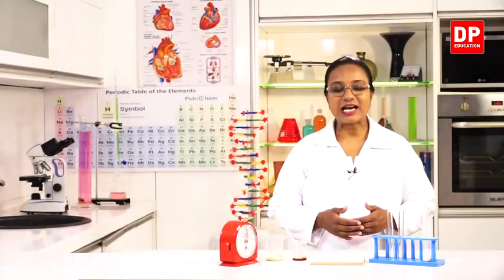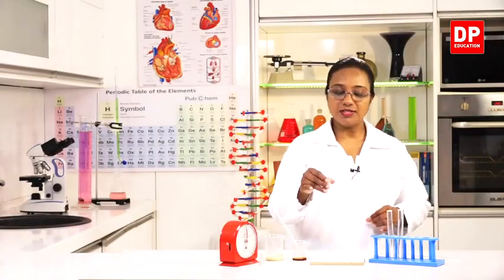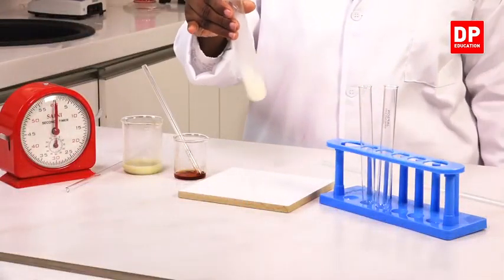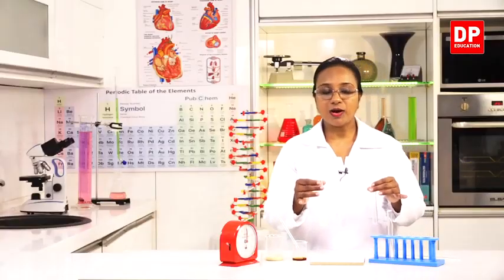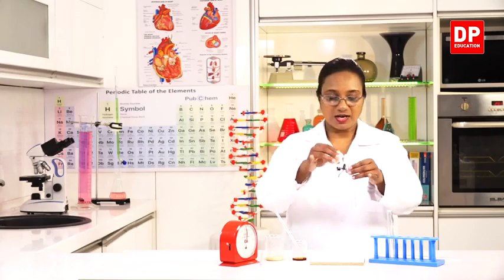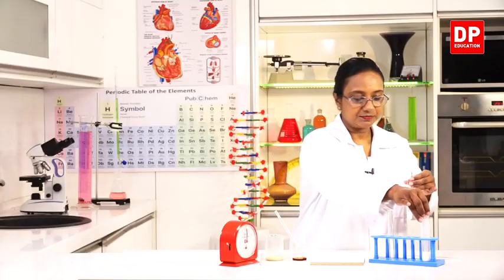Now, we will start the activity by taking 2 milliliters of the starch solution. So, before taking the solution, I will mix it well. Since this is not a quantitative activity, I will take a small amount of starch, about 2 milliliters.